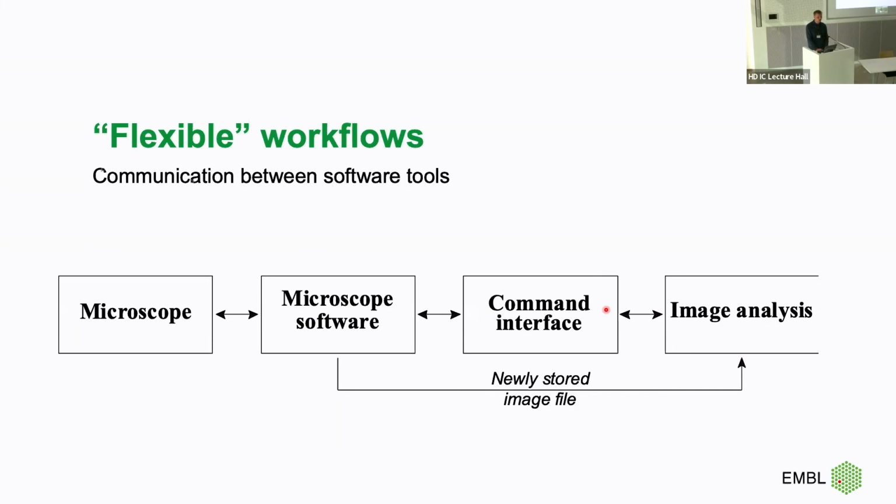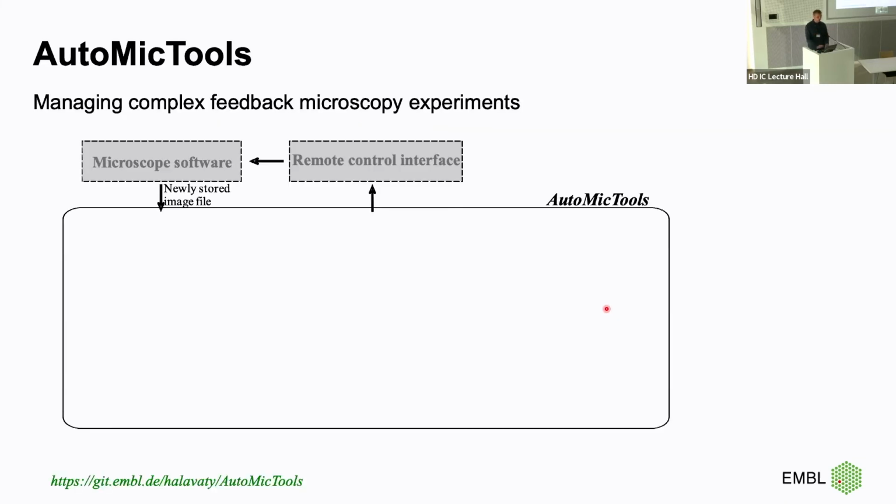So in the last few minutes, I want to talk about how we went about it, but of course it's only one example of how it works. As I already said, we have a microscope software and we have a remote control interface, which translates our commands, but we want very flexible, expandable and customizable workflows on the image analysis side.